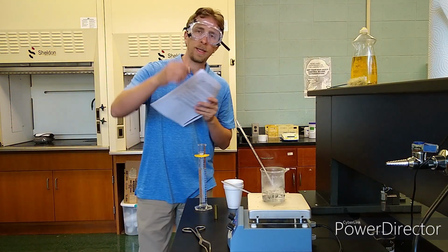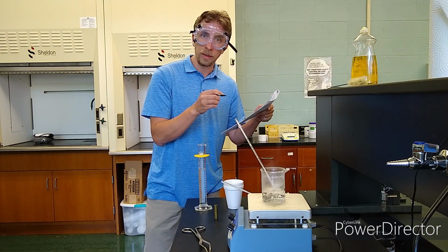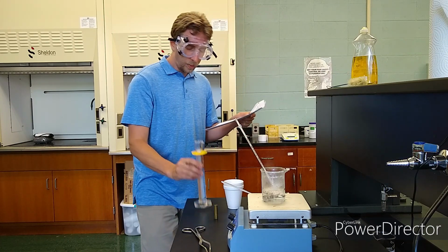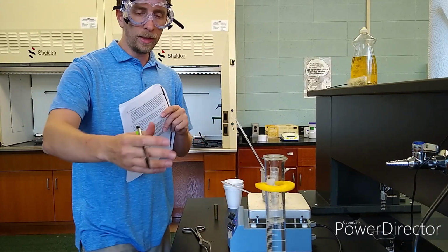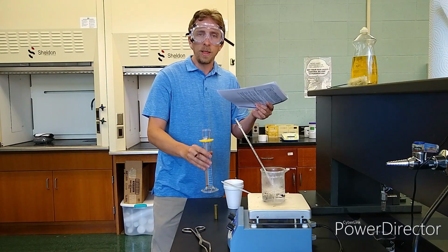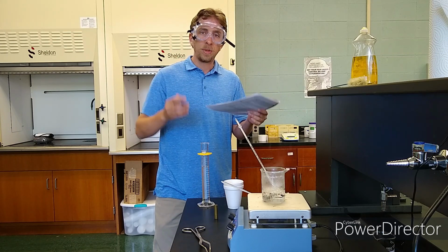Now do you know how many times I see in the labs, people write down 79.6 milliliters, or they write down a volume, and then they say, oh, mass of water. And then what do they do? They pick this whole thing up and go over to the scale and they put it down on the scale and they say, what? That's not right, because that includes the mass of the cup. You don't even need to measure the mass of the water. What did we learn from our density labs?